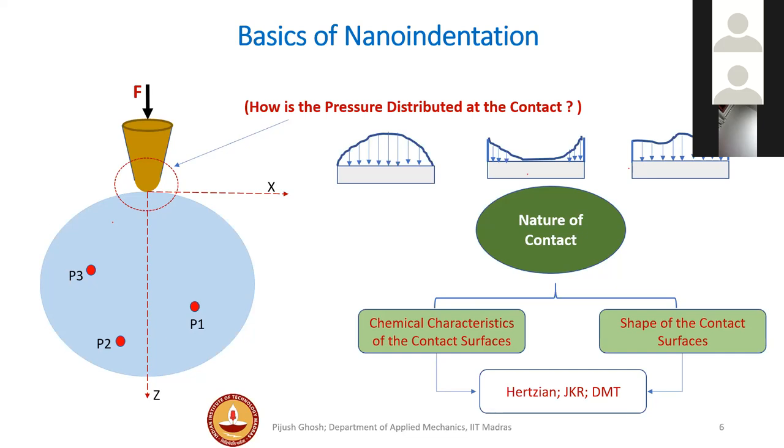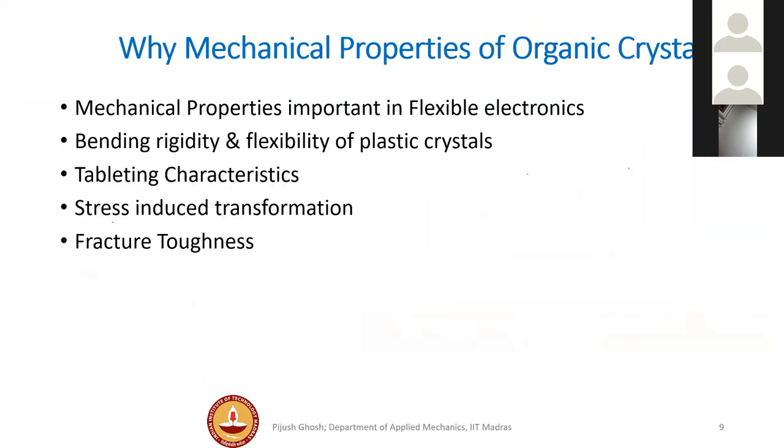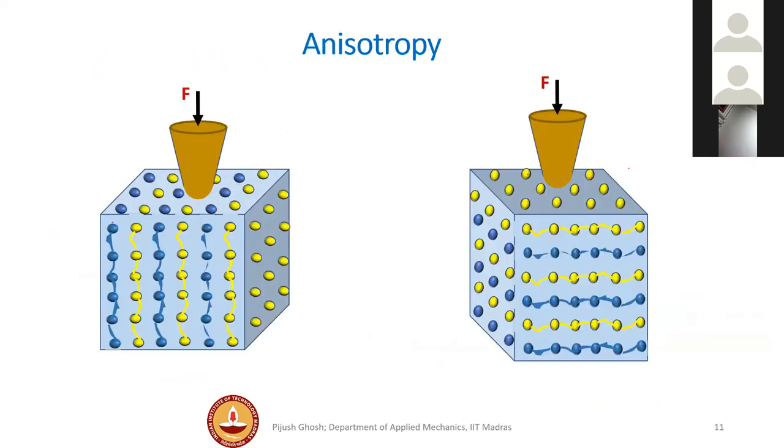Okay, that is one. And the anisotropy part, I think I have already talked about that. It is important to understand your structure, and then see which face you are indenting. If you have a very obvious anisotropy like this, you can understand that if you are indenting on the face on the left versus the right, you would expect a different response from the material and thus different mechanical properties. In brief, we can talk in detail later if you need, but this is what I would say to address the question.